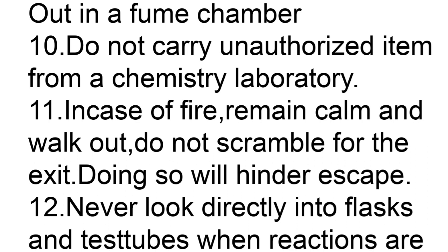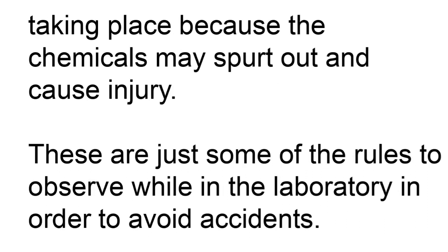In case of fire, remain calm and walk out. Do not scramble for the exit because doing so will hinder escape. So in case of fire, don't panic. Just walk out slowly and do not scramble for the exit. Never look directly into flasks or test tubes when reactions are taking place because the chemicals may spurt out and cause injury.